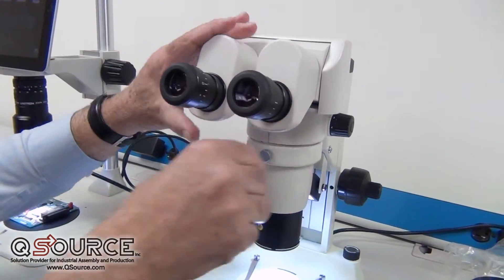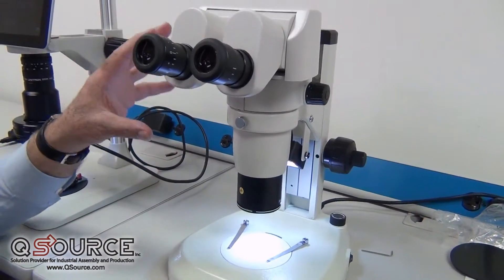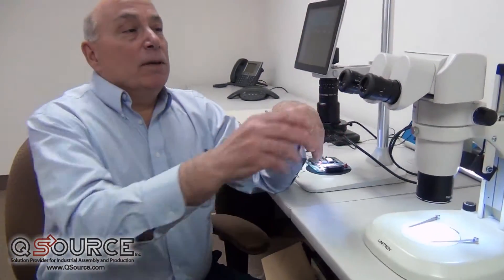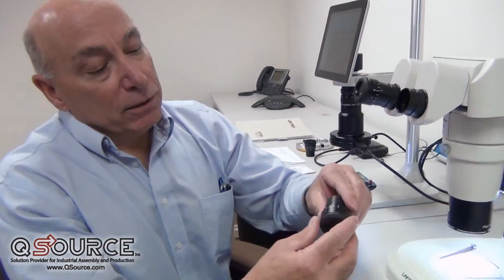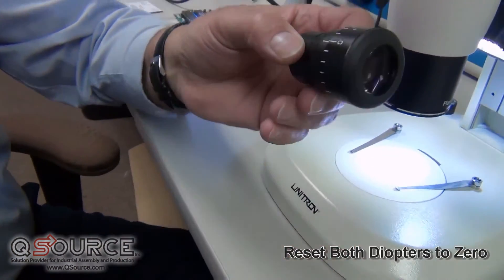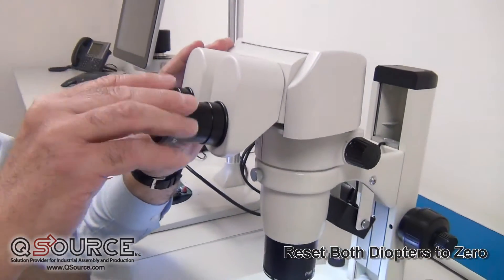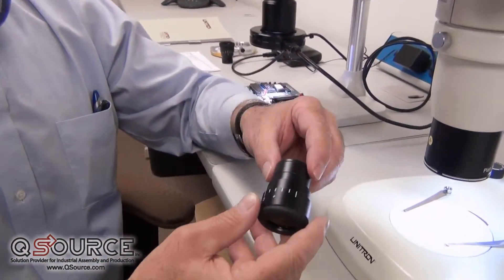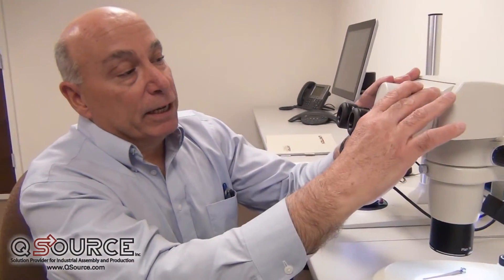which simply means that we can adjust the eyepieces to many different angles and different heights for different users. When we look at the stereo, we see the eyepieces and the objective. These two need to work in concert with one another. The first thing we want to do is take a look at the diopter settings, and we want to set them to zero. This will set the eyepiece up for somebody with perfect vision, where they have no astigmatism or any other aberration in their eyesight.